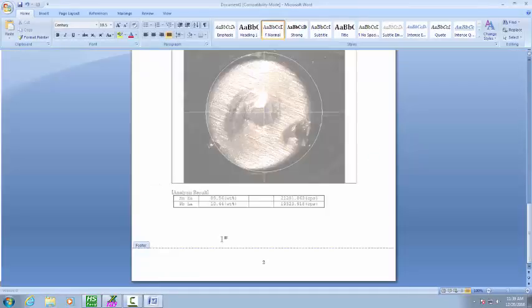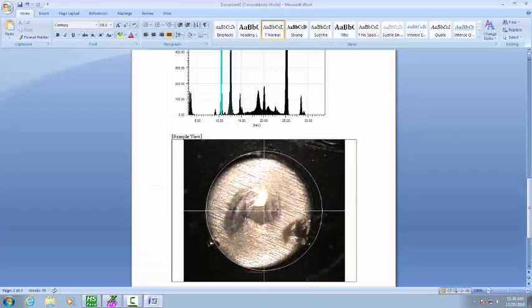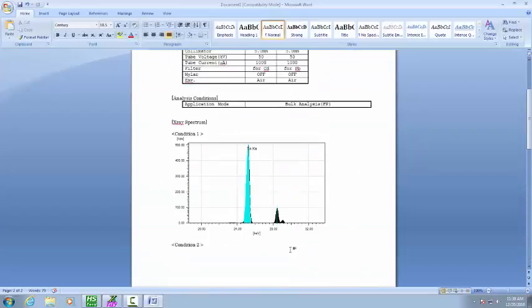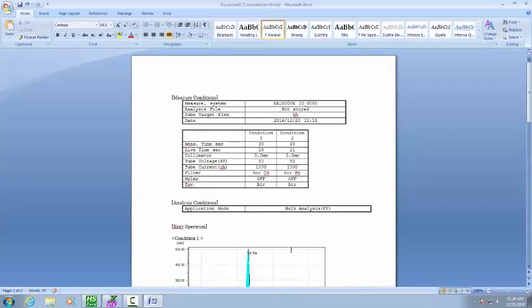It automatically creates the report in Word. We'll scroll to the top. First off, at the very top you can edit this to name it however you want.